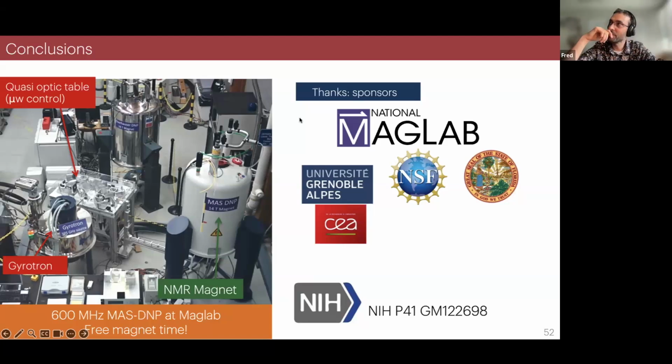Oh, this is a very good question, Asif. In an ideal world, I would love to have a setup that can do EPR and DNP under the same conditions, because not only would we have more accurate values for simulations, but we could also debug the sample immediately in situ. You could just pause, look at the EPR and be like, ah, okay, this is not working for that reason, or have at least some clue.